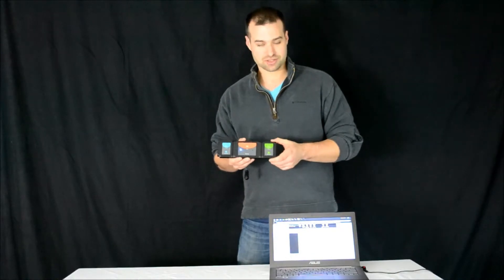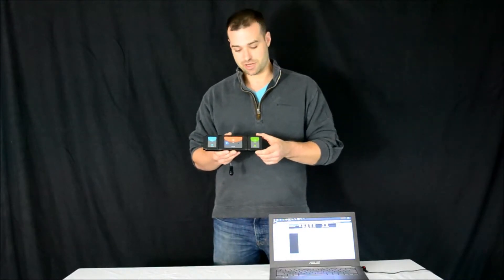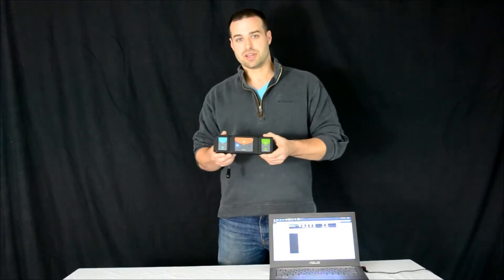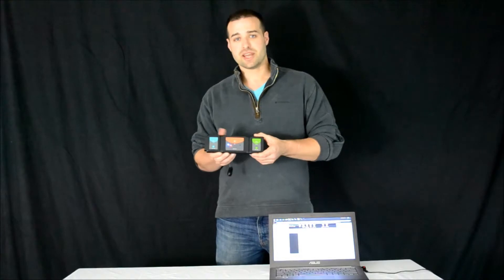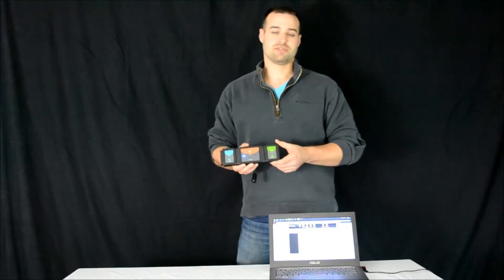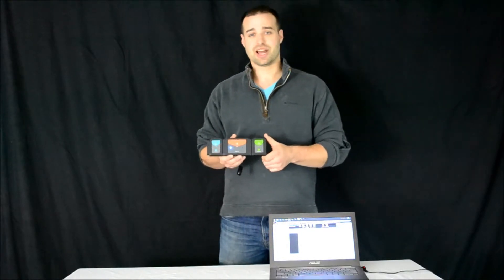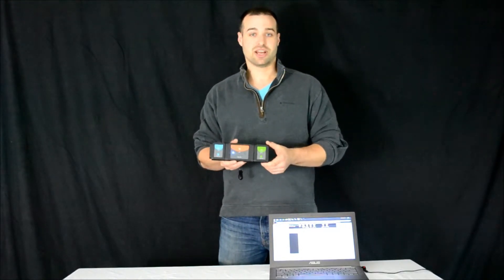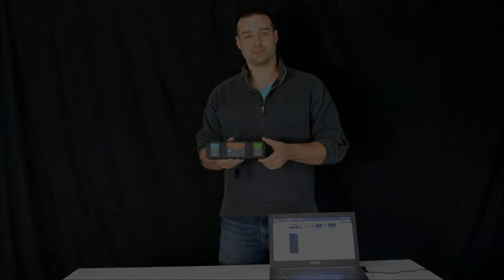All you're going to need is a Nulog battery module, Wi-Fi module, up to five different sensors, and a wireless capable device such as an iPad, a droid tablet, a laptop, or even a smartphone.